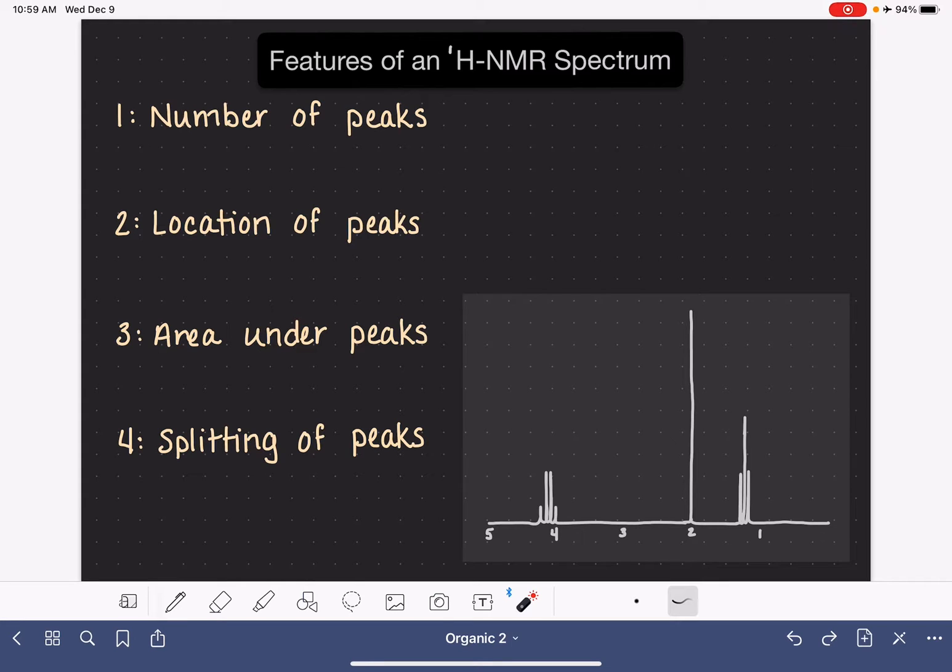Each proton NMR spectrum contains four really important pieces of information that can help us determine the structure of a molecule. In this video, I'll be going over those four pieces of information and talking about each one of them very briefly. I won't be teaching you how to do any analysis in this video, I'll be doing that in the next few videos.